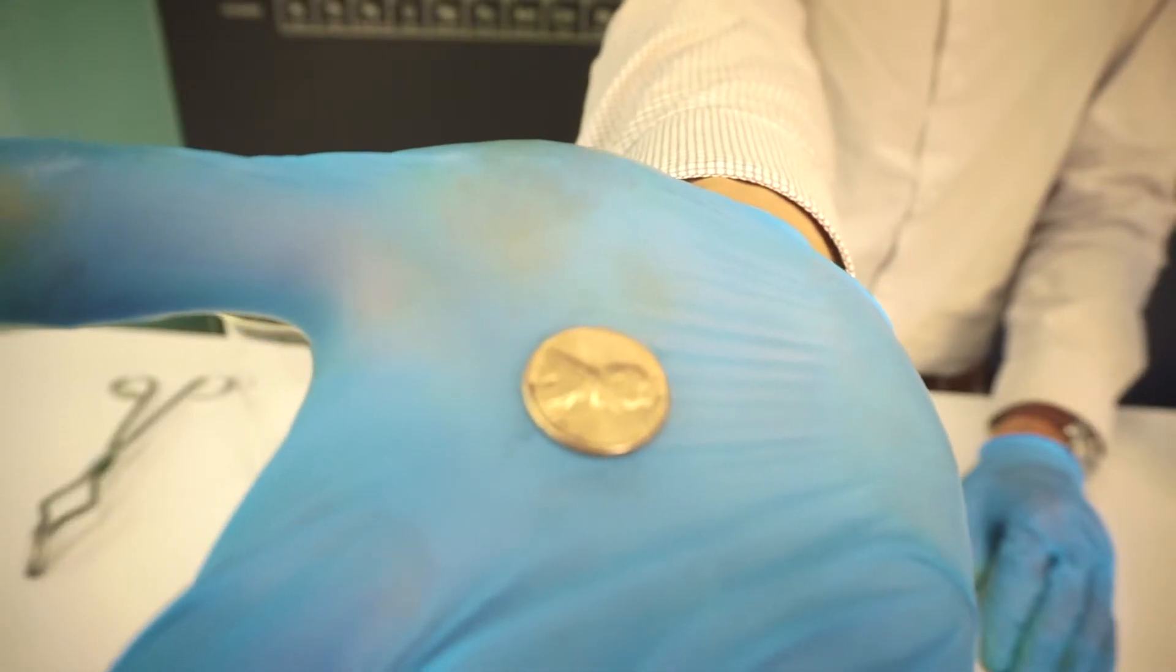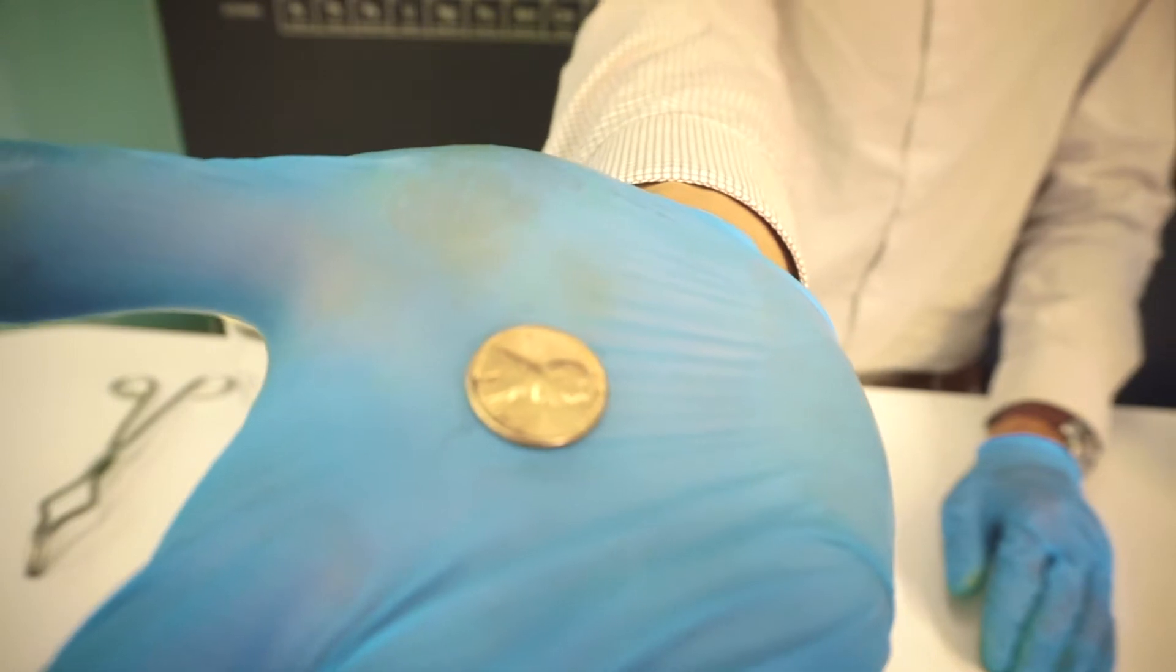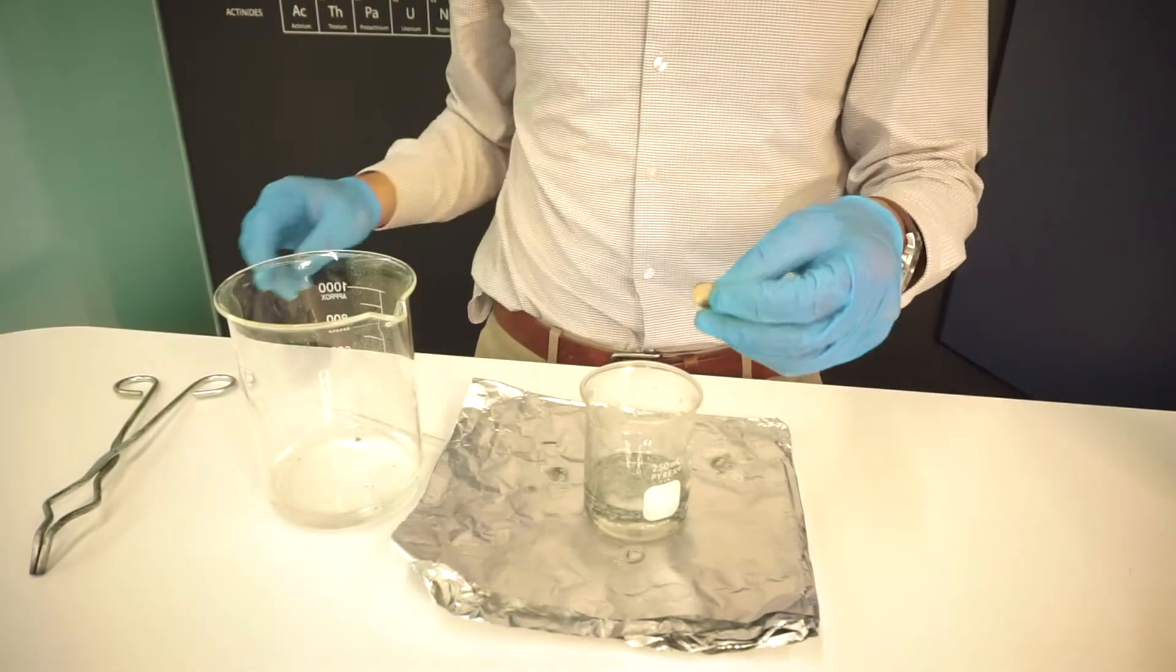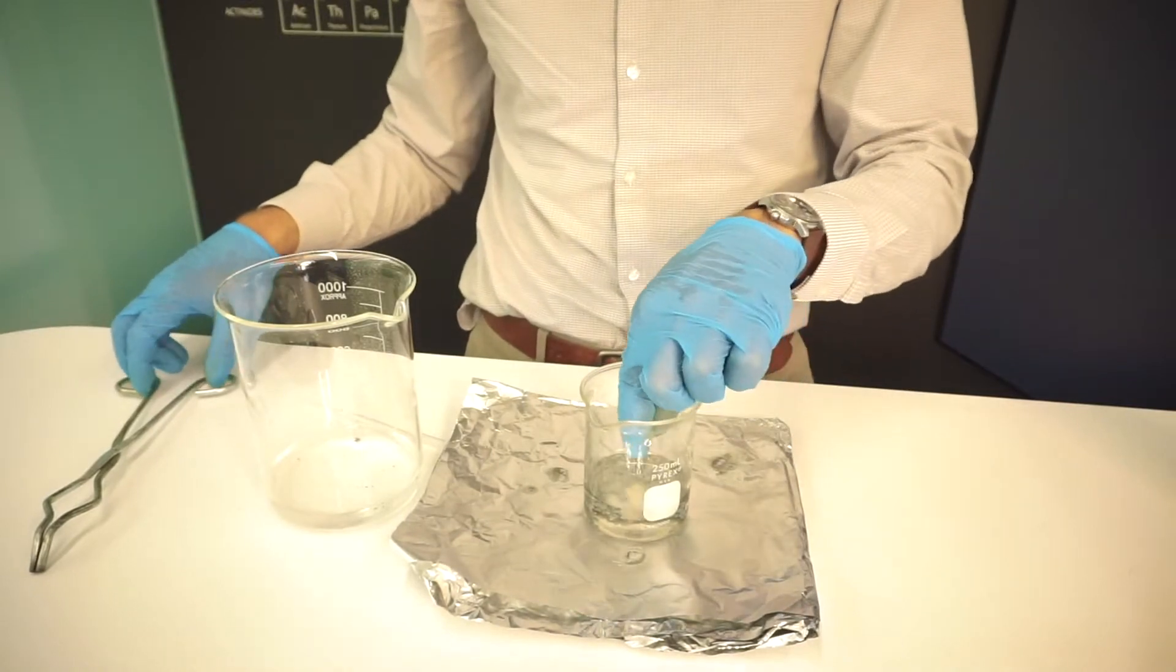All right, so we just have a normal US penny here made out of copper on the exterior, and we're going to see what happens when we put it in a solution of sodium zincate.